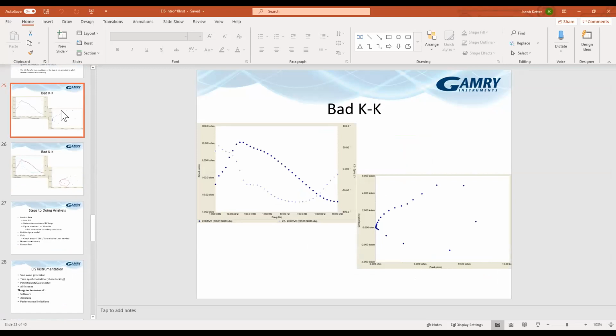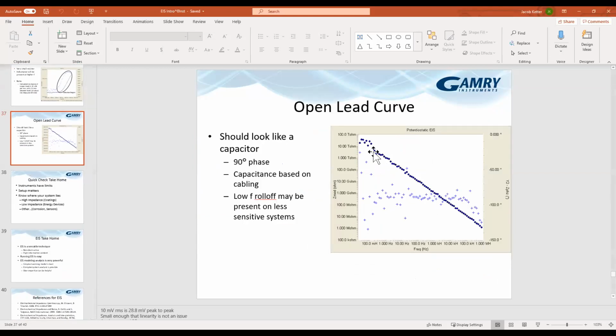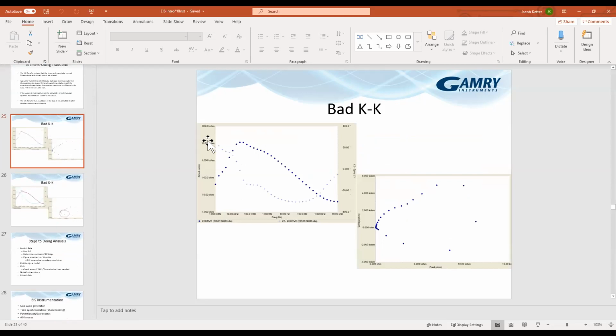Okay. All right. So let's deal with the first part first. Noise at low frequencies can come about for several different reasons. One of them is this open lead. If you're measuring something that's incredibly high impedance, you can see noise just because you're at the signal to noise limit for the system when you're trying to measure picoamps or femtoamps worth of AC current. You're going to have noise there, even if you're inside of a Faraday cage, which this case is.